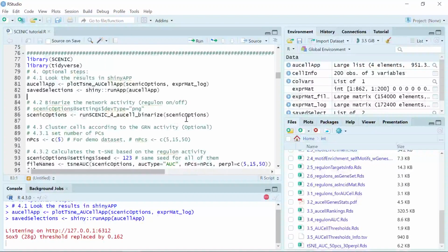object. As I said, you don't have to do this step if you have clear cell types, but this step is very useful, especially to reduce technical bias. For example, we always talk about the batch effect and the number of detected genes or total counts. This step is also very useful to group datasets by the origin of patients.